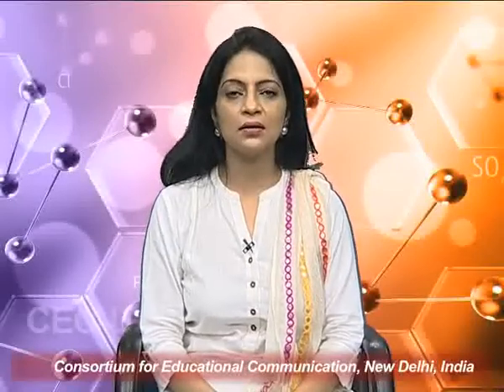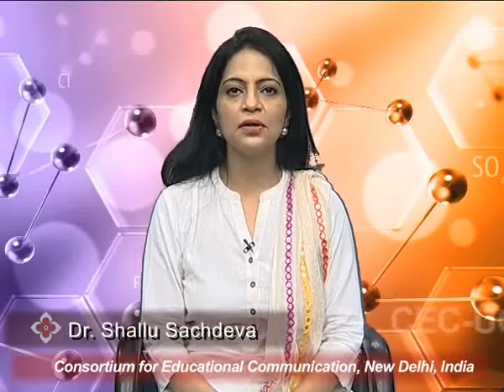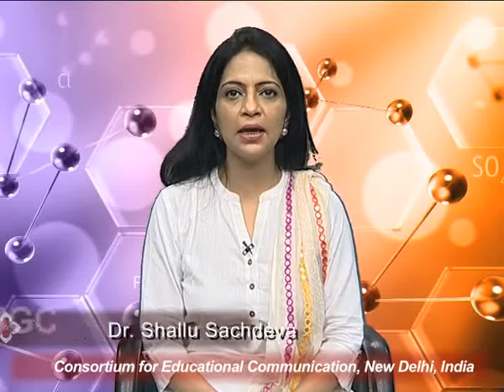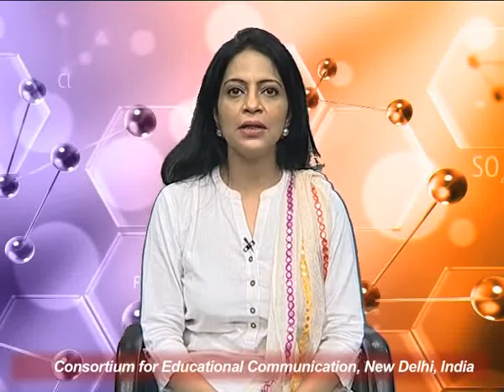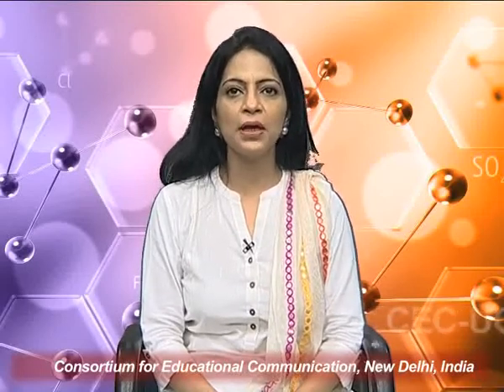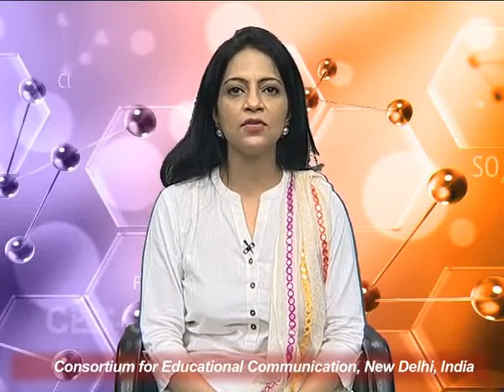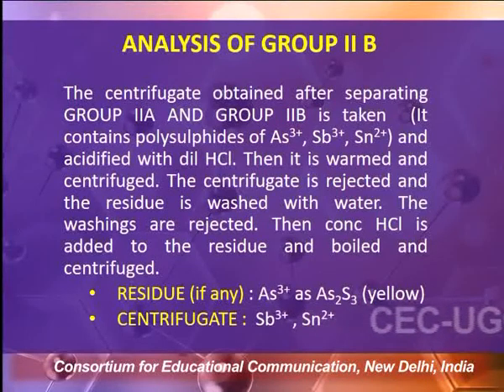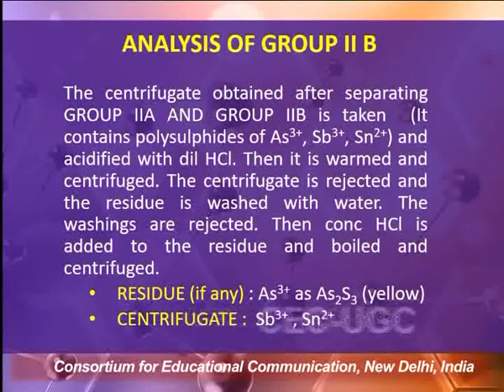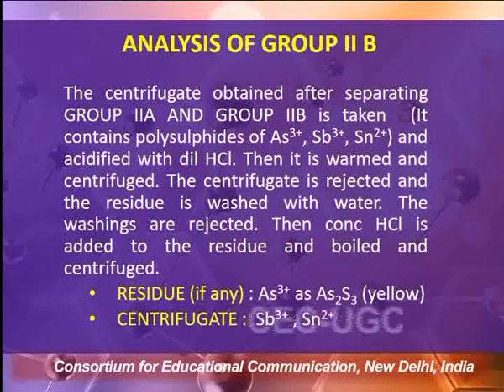Continuing with our part of qualitative analysis, we have completed the analysis of group 2A in our last lecture. Continuing with that, the analysis of group 2B cations, wherein the centrifugate obtained after separating group 2A and group 2B is taken. Group 2B centrifugate contains polysulfides of arsenic, antimony and tin, and then it is acidified with dilute HCl.